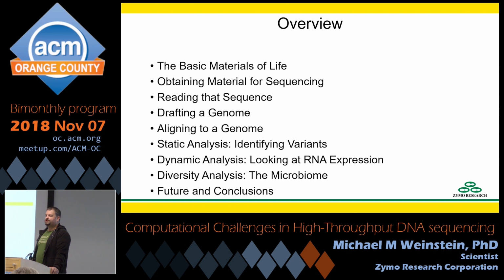these are going to be more for just examples to give people an idea of what sequencing is being used for. So there'll be a more static analysis, and I'll talk about why I call it that in terms of variant identification, a more dynamic analysis looking at RNA expression, and a diversity analysis looking at microbiomes, which is something that I'm very active in right now. And then I'll conclude by talking about some of the big future areas that are of keen interest.